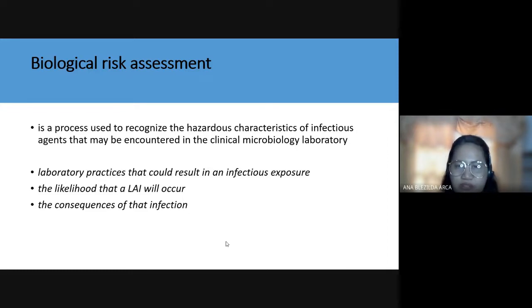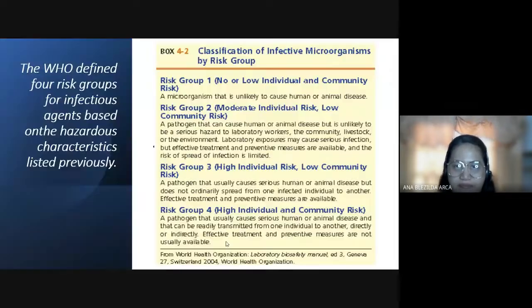Kasi nga naman, tulad sabi ko kanina, kapag bacteria, saan dapat i-process? Inside the biosafety cabinet. Pasaway ka, na-expose ka tuloy, 'di ba? Di mo kasi sinusunod yung protocol. Basta class, huwag kayong matatakot dito. As long as hindi ka pasaway, hindi ka magkakaroon ng sakit dito. Okay? Walang problema diyan.